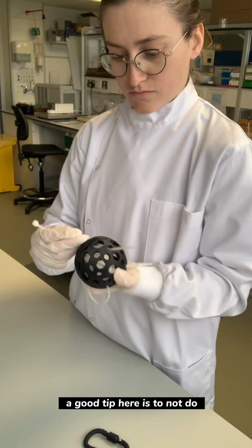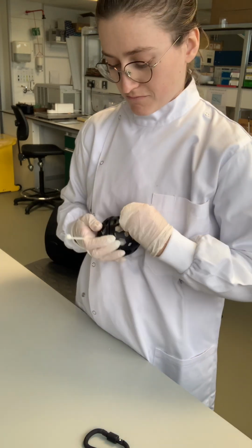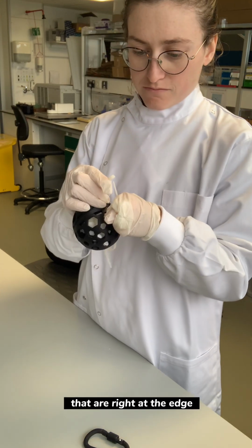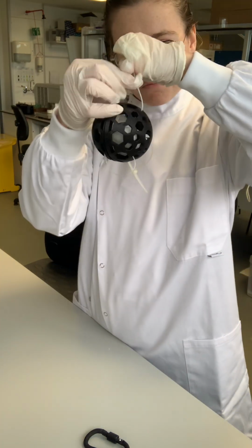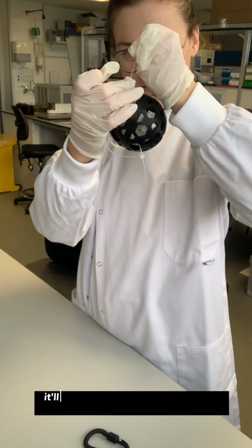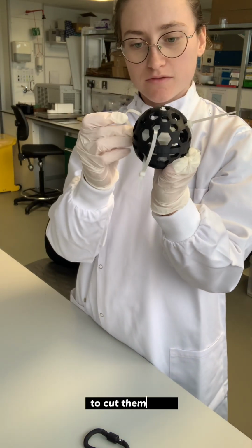A good tip here is to not put a zip tie through holes in the Metaprobe that are right at the edge. If you do them a couple apart, like you can kind of see in the video, it'll be easier to use your scissors in the field to cut them open.